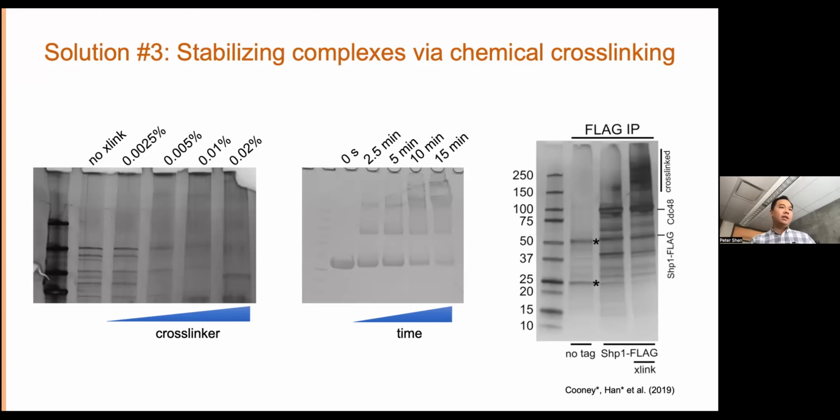What happens if the cross-linking gives a complex which is not real? I think this is the age-old question, the age-old concern with introducing any form of fixation or cross-linking. I don't have a really satisfying answer to your question, but I'll just say let the structures speak for themselves. It's always a specter that's looming in the back of my mind, but that's also a reason why, when we cross-link, we strive to achieve a balance between uncross-linked and cross-linked material. Yeah, it's an important question.